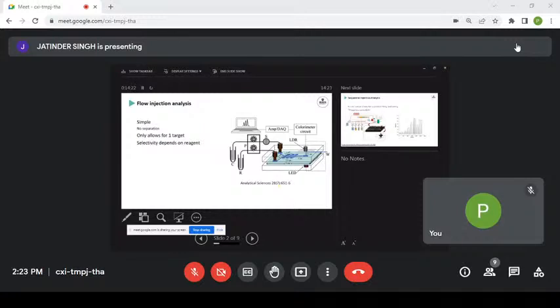So here, this allows us to get a little bit of a sample in, and then we get the reagents kind of sitting in a tray. So in this microchannel, the flow from this channel goes to the intersection, flow from this one goes there. Then we've got the little serpentine in here.